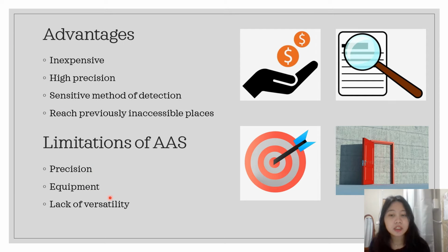The second limitation is the equipment. The equipment is expensive, so it cannot be used widely in a lab because it is much more expensive, but it is more portable than the previous instrument.